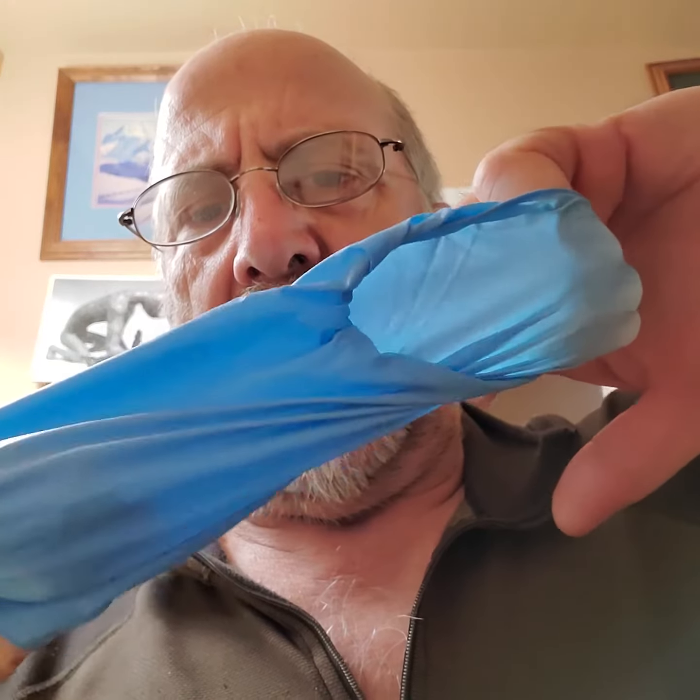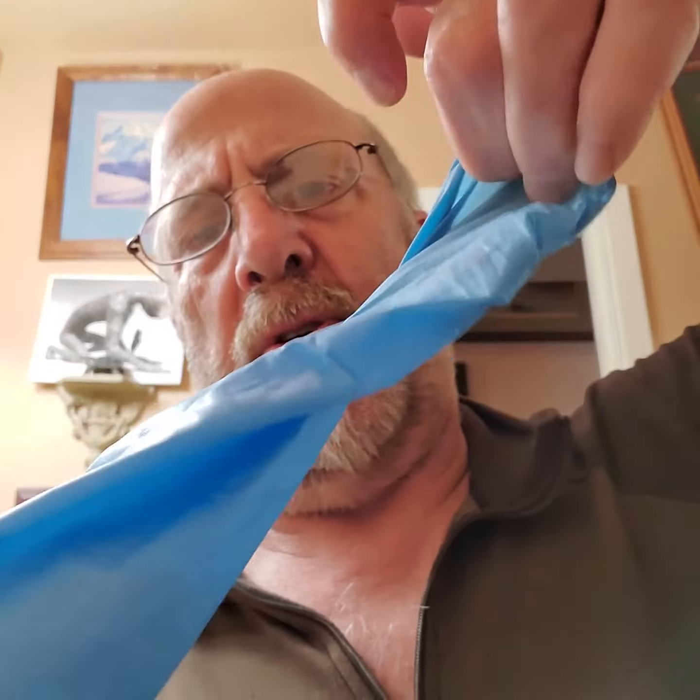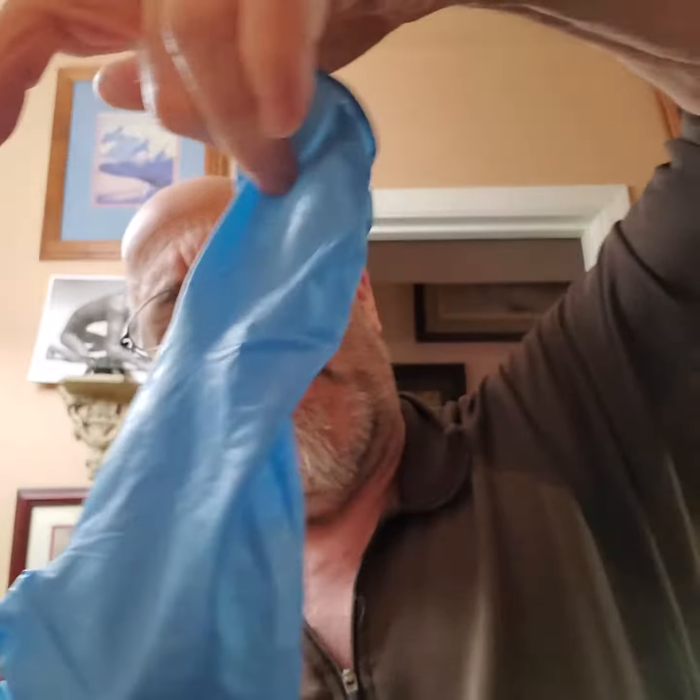Let it reverse itself, and now I have two gloves — both contaminated — contained together, and I can drop them away. Boom, that's it.